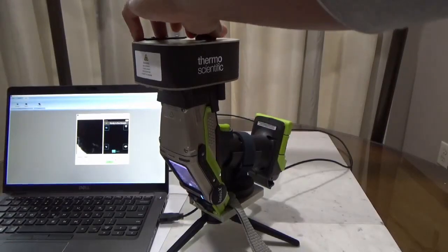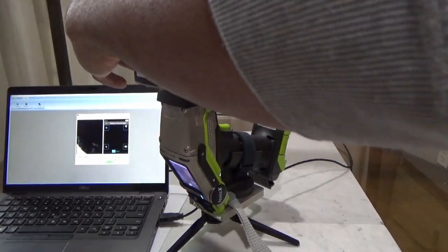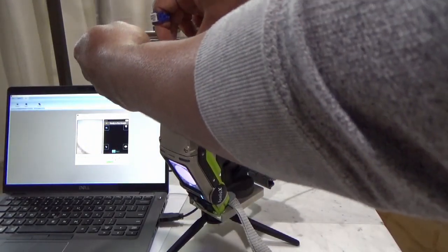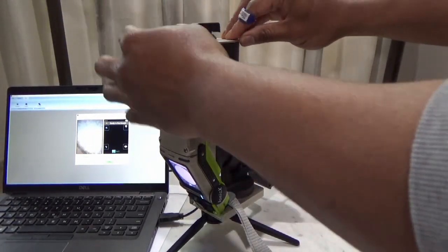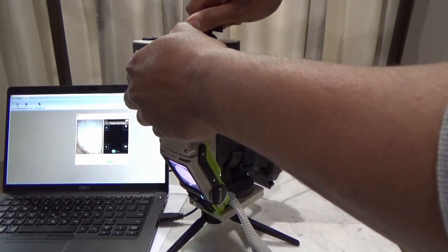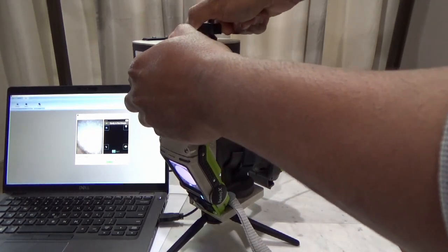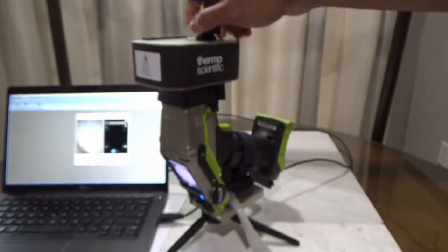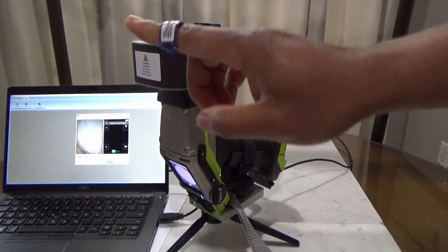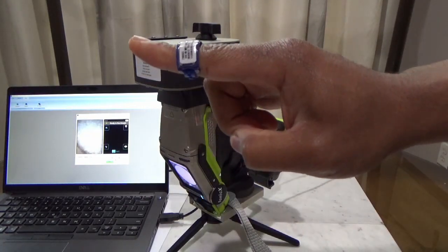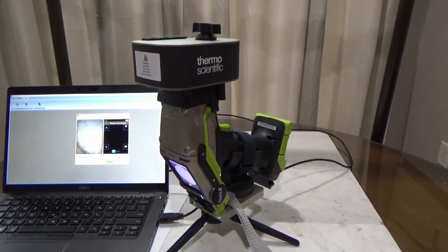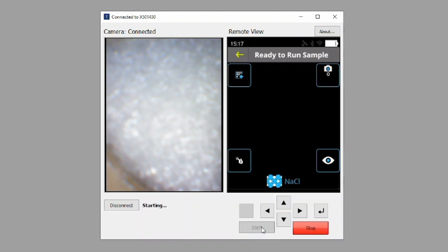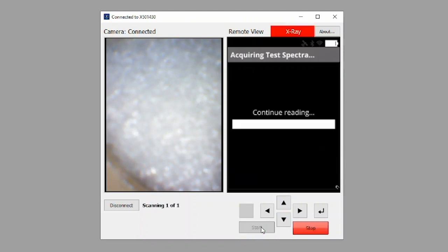Open the top of the sample compartment and insert your prepared sample. Be sure to securely close and lock the lid to ensure the safety interlock is engaged. Note again the radiation monitoring device I'm wearing as part of safety protocol. Note on the camera connected view, the sample has been properly placed. With sample in place, click the green Start button to begin the analysis.